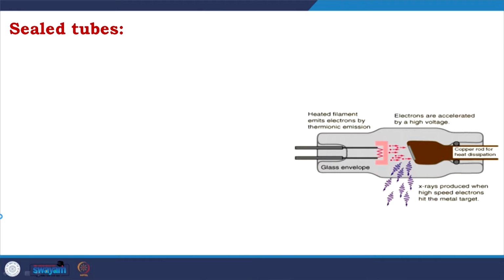So, that is the reason I talked about this, but this is again very important to remember. X-ray is used because the range of X-ray is in the range of atomic distances, the bond distances. If you look at protein, there is carbon, nitrogen, oxygen mostly, and those are bonded within 1.5 angstrom around. So, that is why X-ray works perfectly.